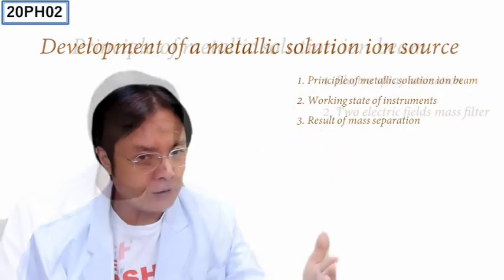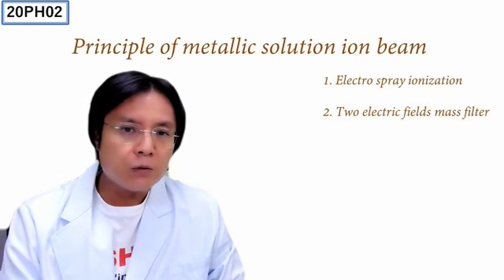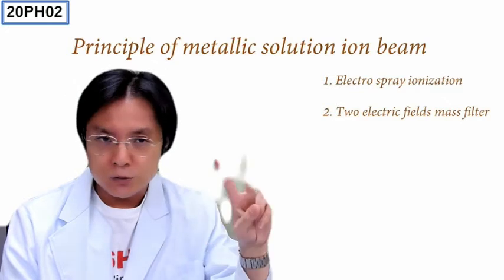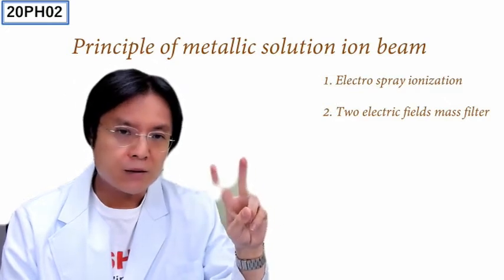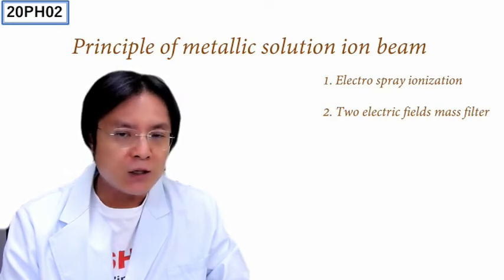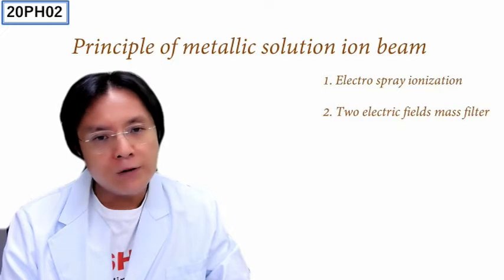Okay, going on, here shows the principle of the metallic solution ion beam. This technique utilizes two important basic principles. One is the electrospray ionization technique, which is so famous for the Nobel winner Professor John Fenn.